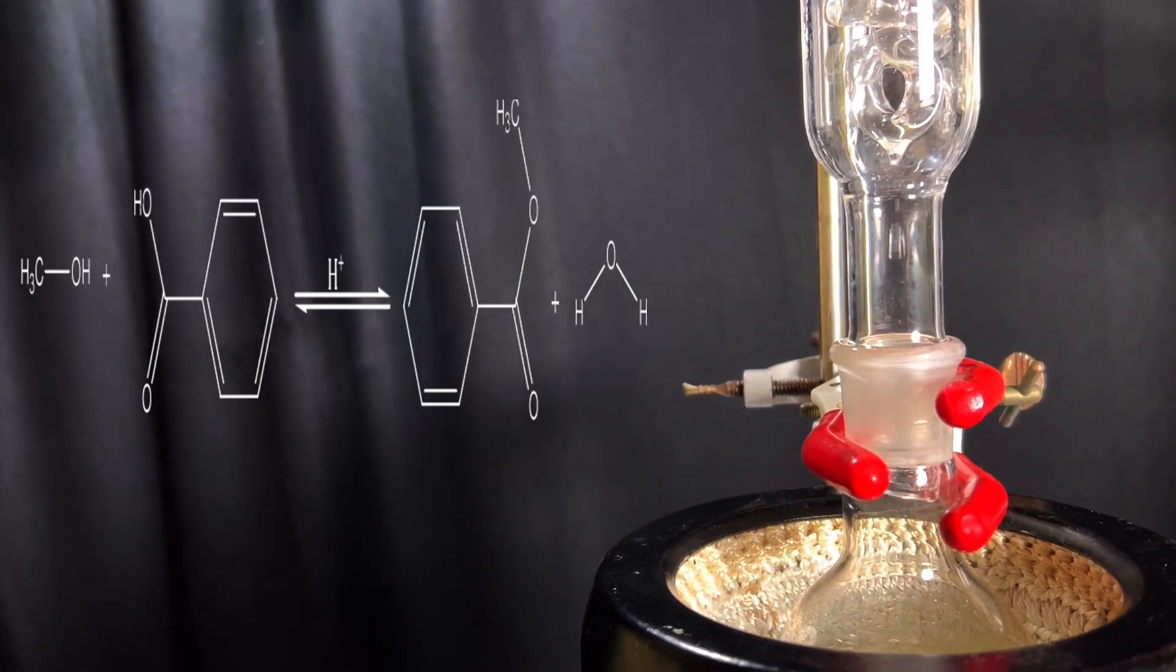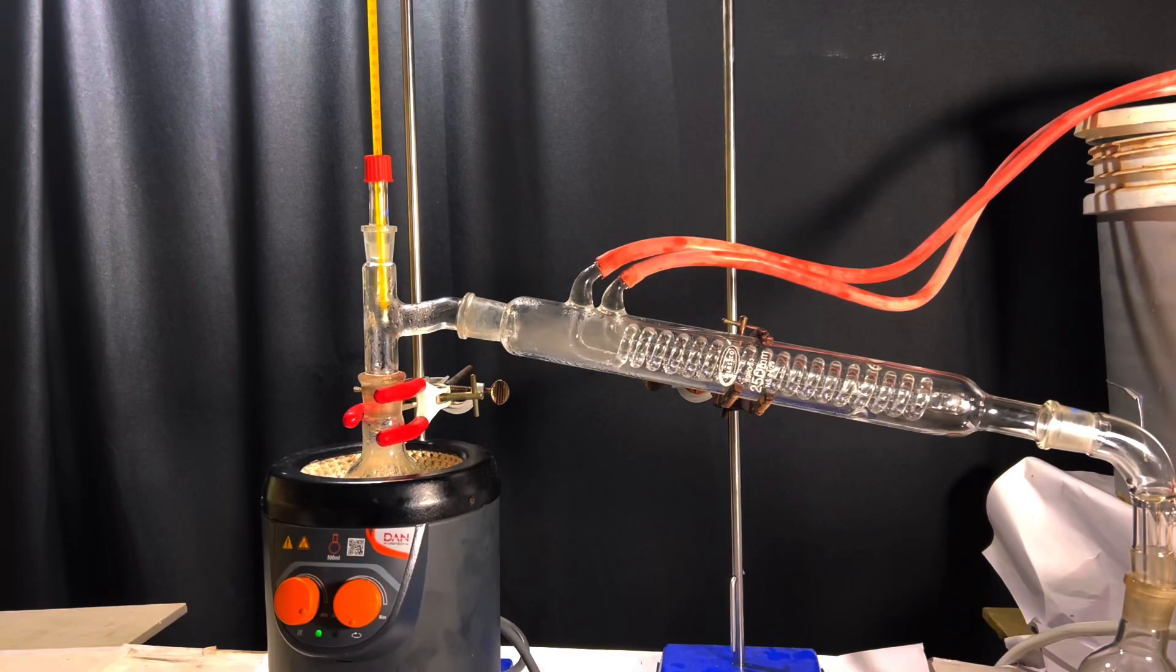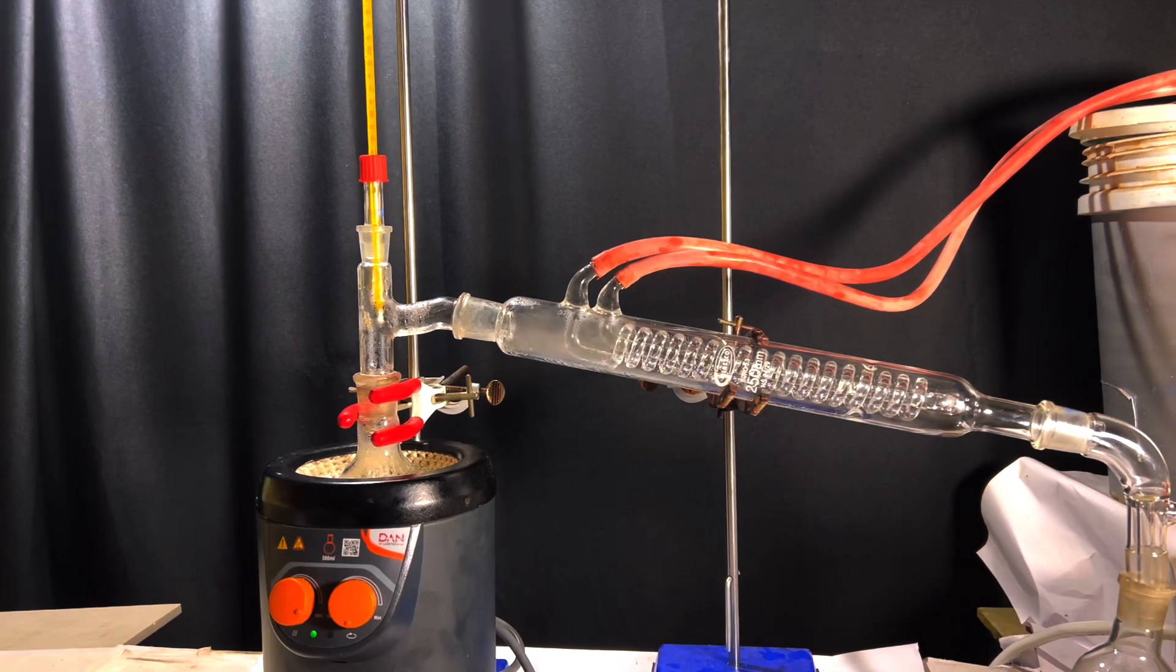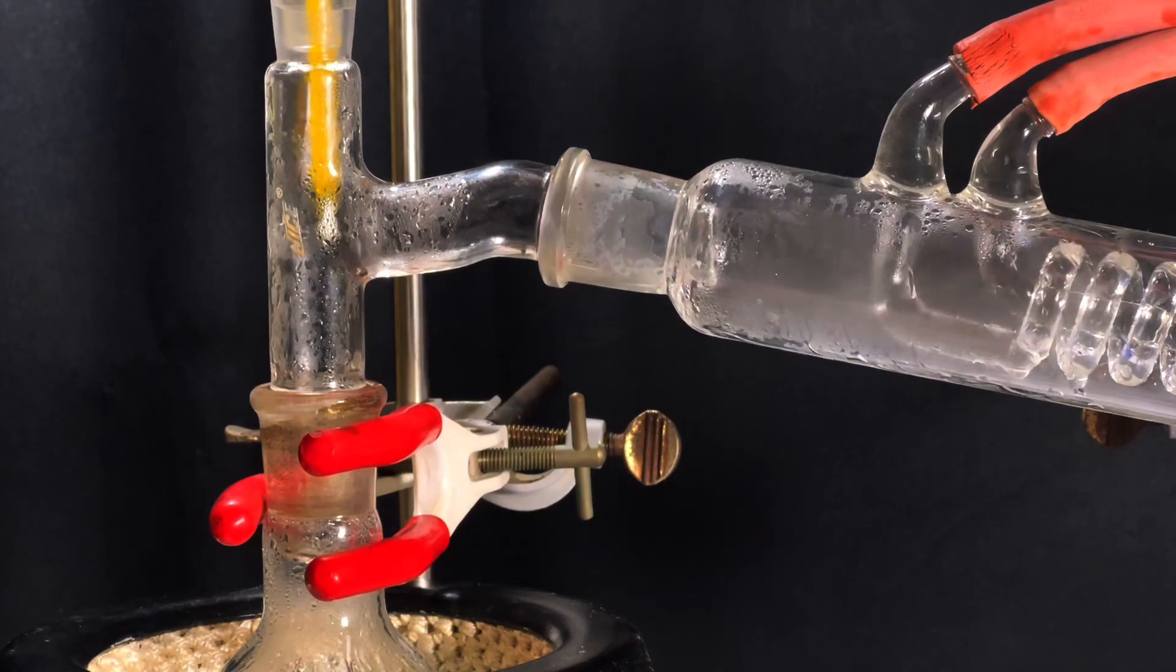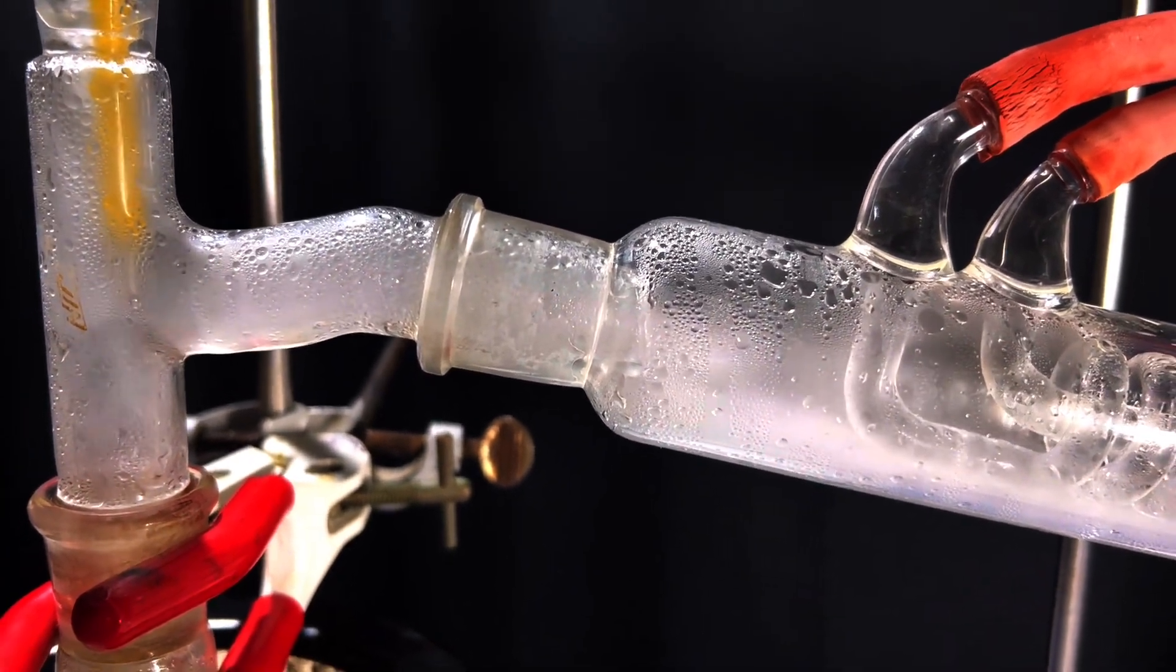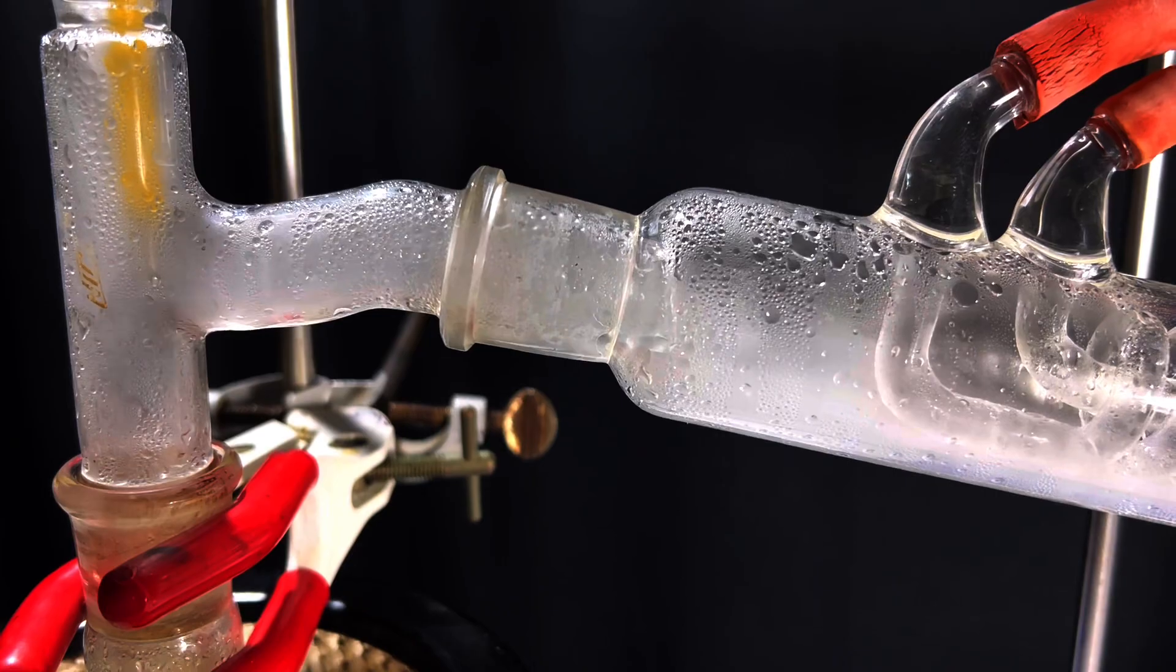After 4 hours the mixture was set for downward distillation. Initially unreacted methanol boils over and then water. And finally methyl benzoate distills over at 199 degrees C. Finally we get the sweet smell of methyl benzoate. It was found to be 7 milliliters.